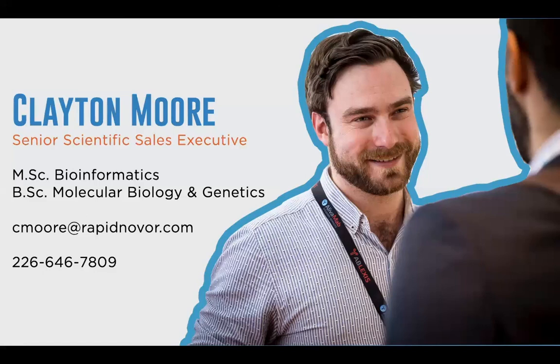Okay, and a couple more. Should the antibody sample be pre-deglycosylated, as glycosylated proteins are problematic to analyze with mass spec? No, you don't necessarily need to do any processing on your end. We treat our antibodies with a number of chemical modifications, which we've spent many years developing, so you essentially don't need to remove any glycans.